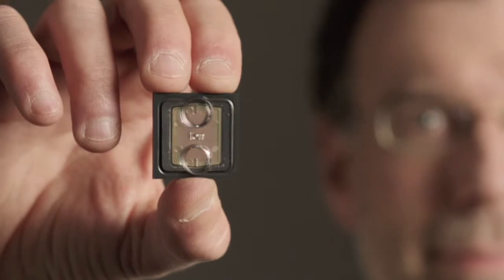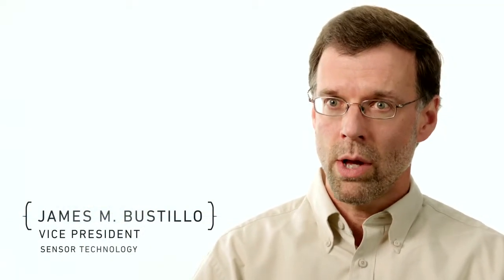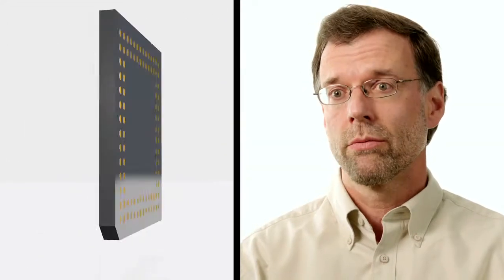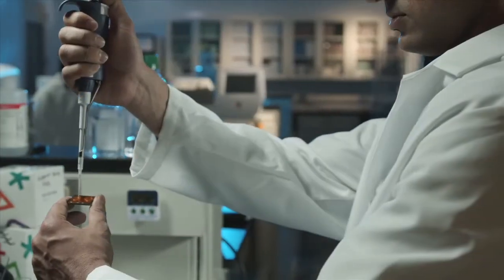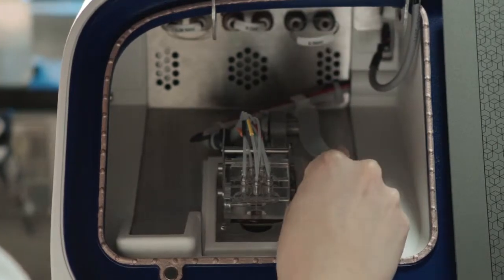Our biggest challenge in sequencing the human genome was getting all the data off of one chip. Our first chip, the 314, held over 1 million wells. The Proton 2 is designed to hold over 500 million wells. The Proton works really at the core by semiconductor sequencing. And the beauty of semiconductor sequencing is it's really as simple as a CMOS chip.